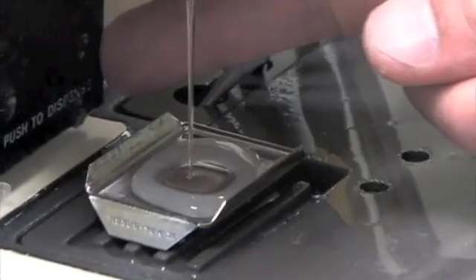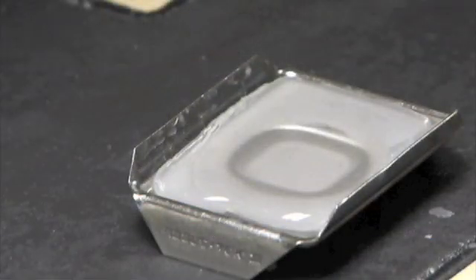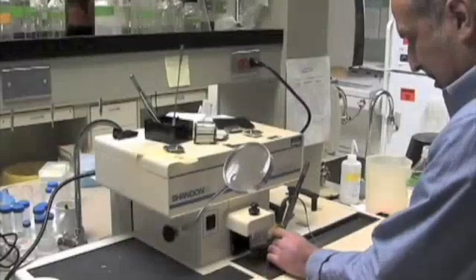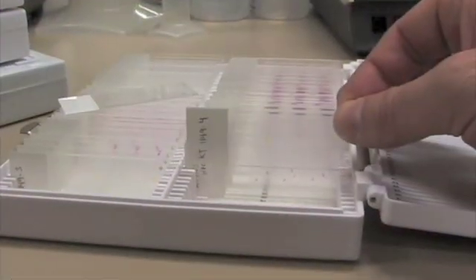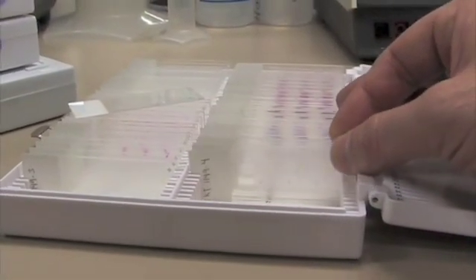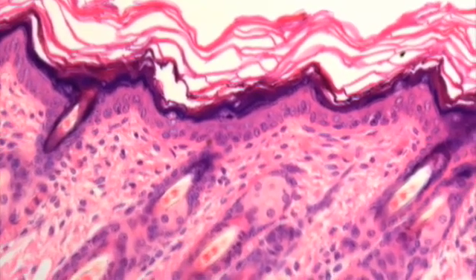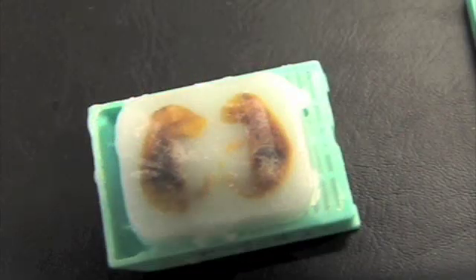In general, core facilities generate more reproducible results. However, if you have the facility and a dedicated operator who has the expertise, sections can be cut in-house. Learning to cut good sections is rather an art form. Therefore, we use a core facility.